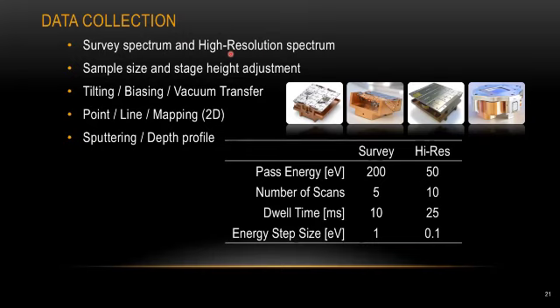And for most XPS machines, there's some kind of sample size limitation. So you want to know the maximum size you can handle for the machine you are planning to use. And you also want to make sure the sample you're going to work on is vacuum compatible. We're going to do all the measurement in some kind of ultra high vacuum environment. So the sample needs to be vacuum compatible.